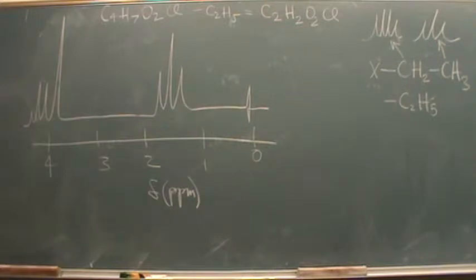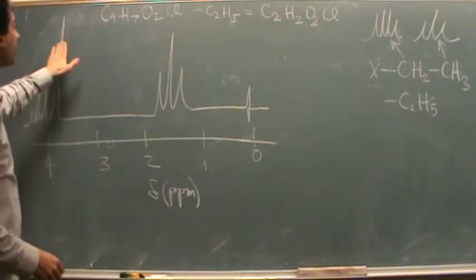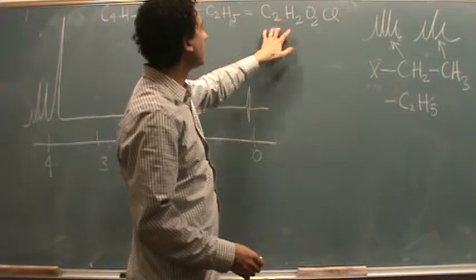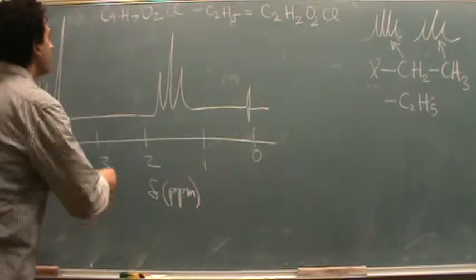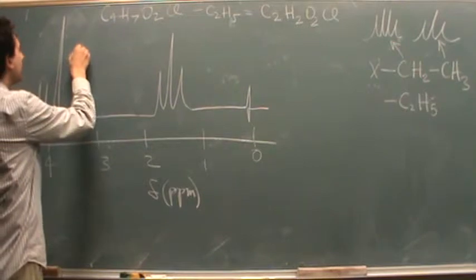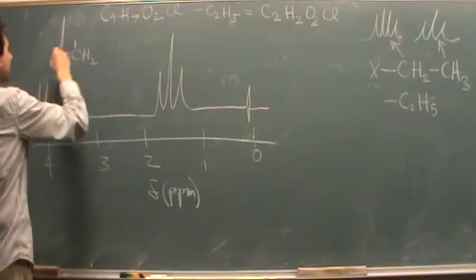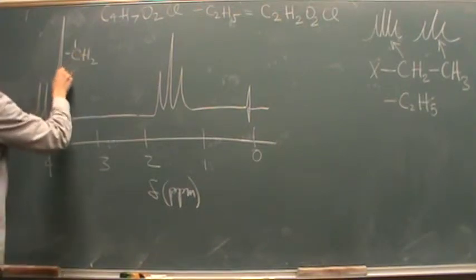Now, what's left, we have a singlet. That's probably caused by this mess here. So it looks like I probably have something like a CH2 from this one.